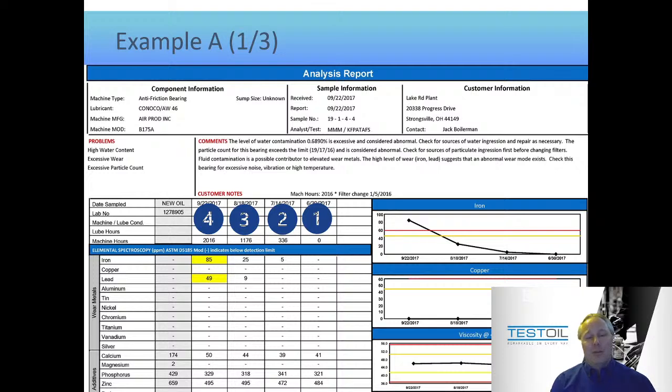And that is the most common mistake that I do find people doing, at least one of the top 3 anyways, is that they don't read every report. If it looks largely like a green report, so to speak, one with no alarms on it, everything is identified as normal, they don't bother reading it. But then when they do finally get a report with alarms on it, they're always like, I wonder if we could have seen this coming. It's like, well, you can, right?